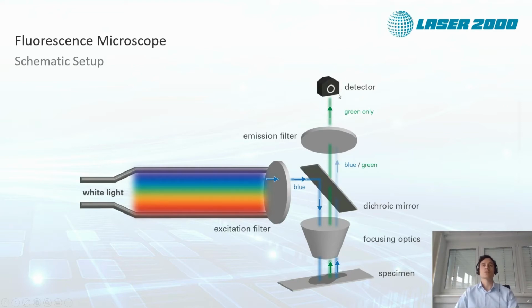I don't focus on the detector today. It's different for different topics. It can be a camera, but it can also be a photomultiplier or a SPAD.